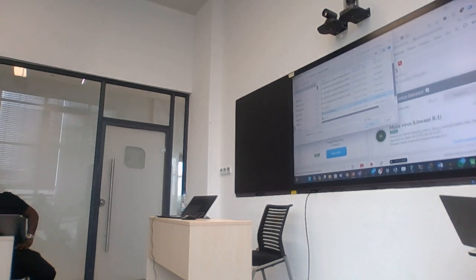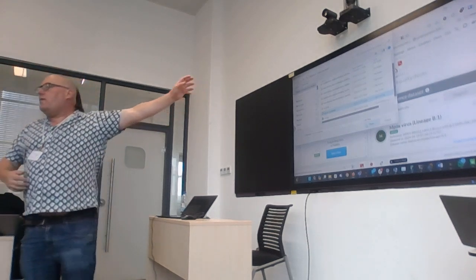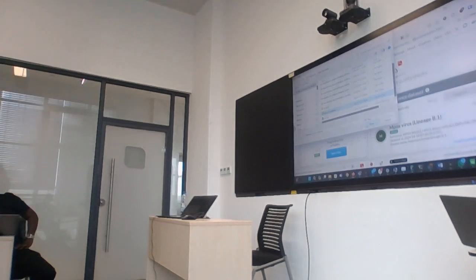And so that means that the size of the consensus is approximately the same size as the initial reference that we used. We've just inserted the differences that we got from the sequencing data, okay? So it's a FASTA file, and if you had more than one sample in your directory, if you analyze multiple samples, then this all consensus file will contain one consensus entry for every sample that you analyze, obviously in FASTA format, okay?